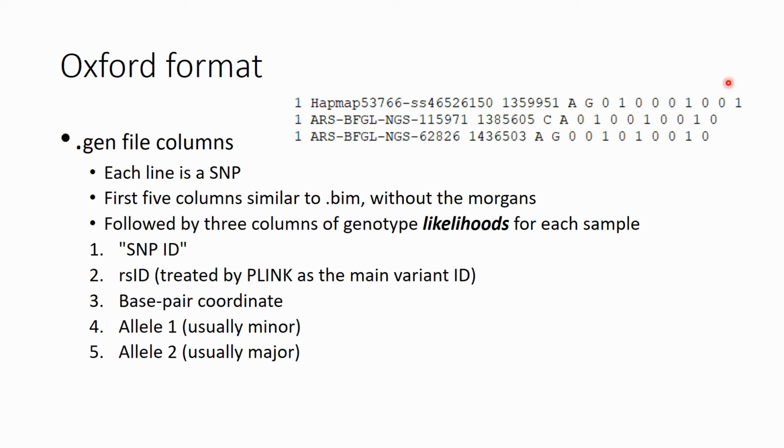And in the same way, the genotypes are coded in this format. Here we have zeros and ones because we are talking about SNP data. But as I understood, these values actually could be different from 1, just indicating the likelihood in some decimal numbers, which then opens up a whole range of other possibilities.